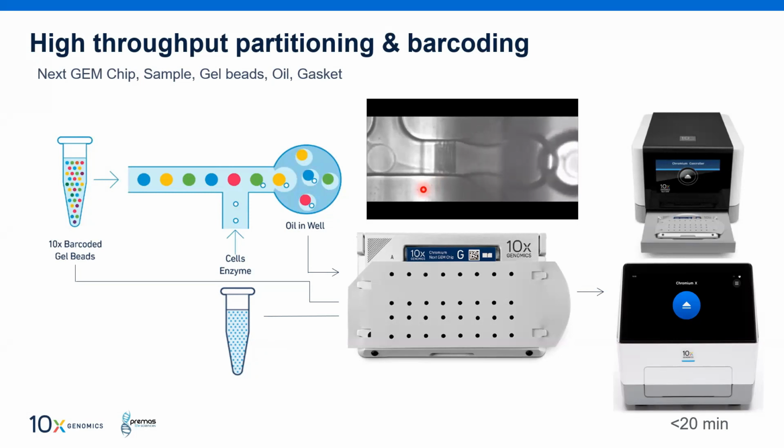efficiency of this particular workflow. Because if you load more cells, the chances of 2 cells in one reaction will be high. So to reduce that, we generate a sufficiently large amount of partitions, or empty partitions, and ultimately you are able to see that a cell is getting captured randomly in these reactions. And every one has its own 10x barcode, so we are able to tag the molecules of those cells.